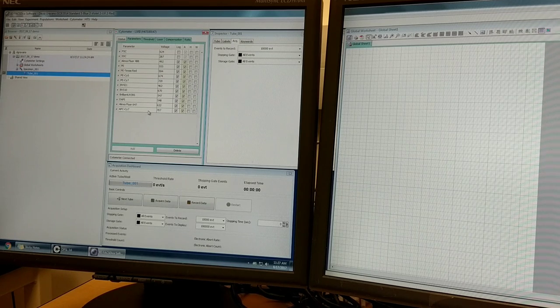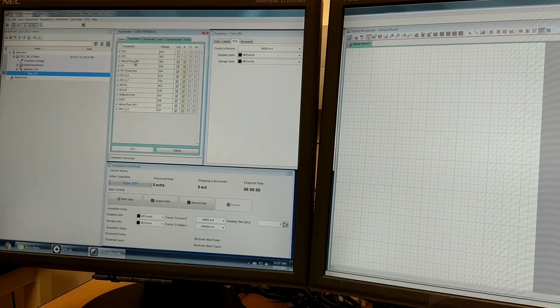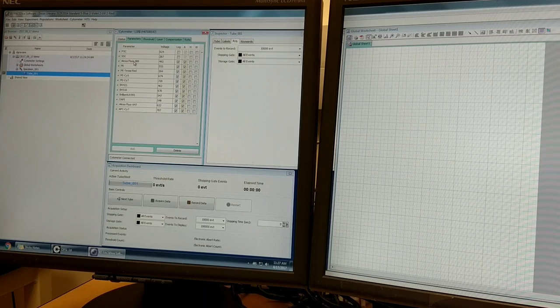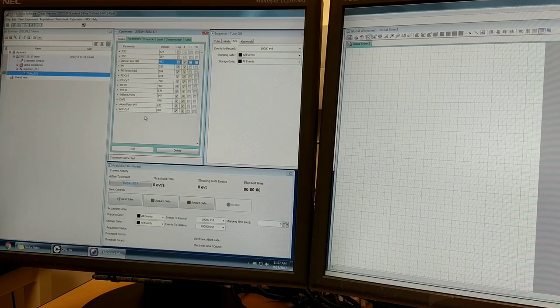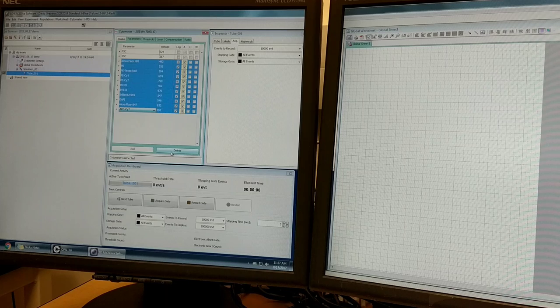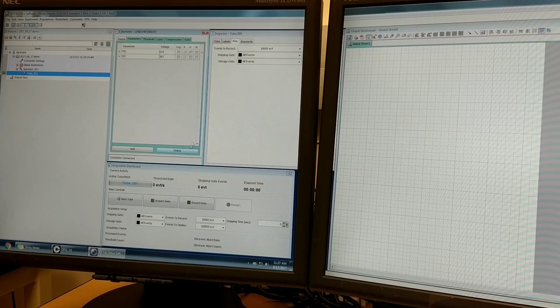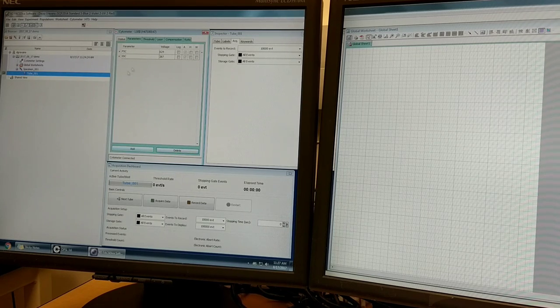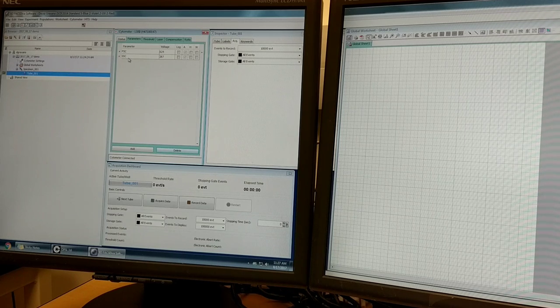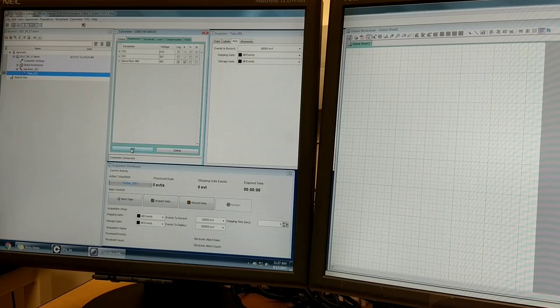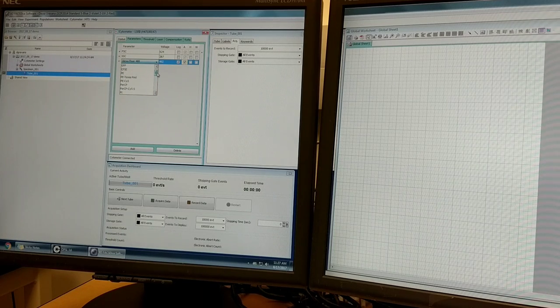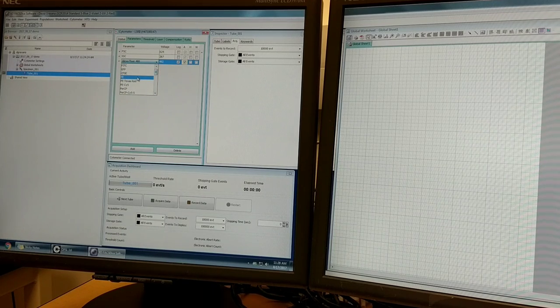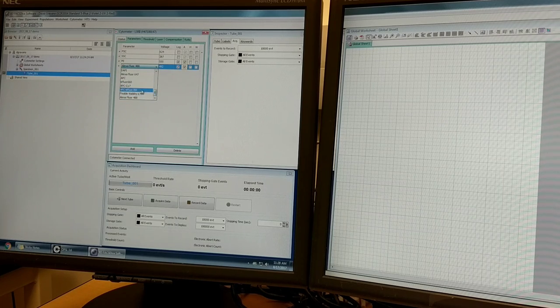So the first step is you have to tell the instrument which parameters you want to measure. I'm going to delete parameters. Sometimes I find that deleting all the fluorescent parameters may be the easiest way to start. We always leave forward and side scatter, then we'll add in by clicking this add button whichever parameters we want.